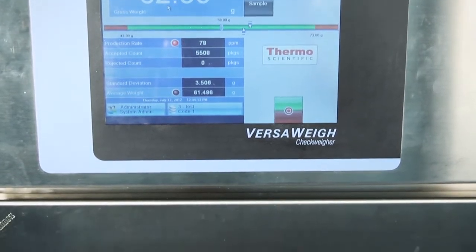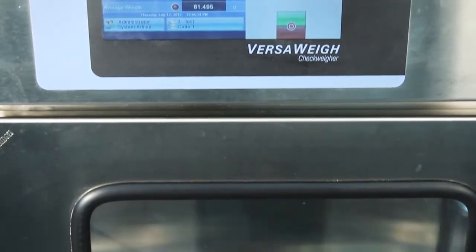On a typical checkware application, once the bottle passes the checkware, that data is lost. It's used to satisfy the reject mechanism, but beyond that it's lost. By employing the bottom code at the bottom of the bottle, we can keep that very critical data — the correct weight of that bottle — attributed to the life of that bottle through the database throughout its supply chain life.